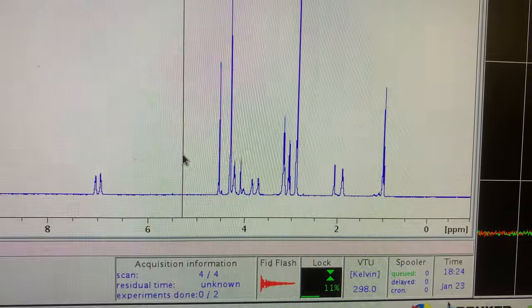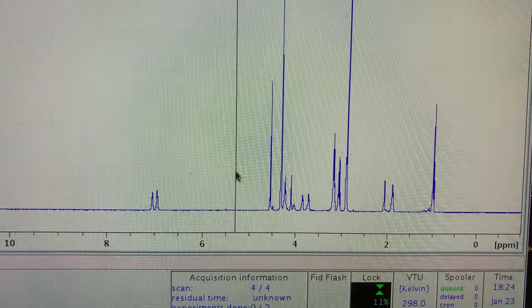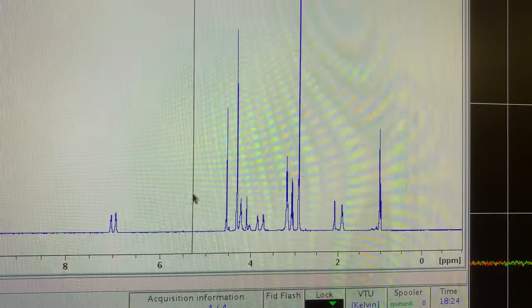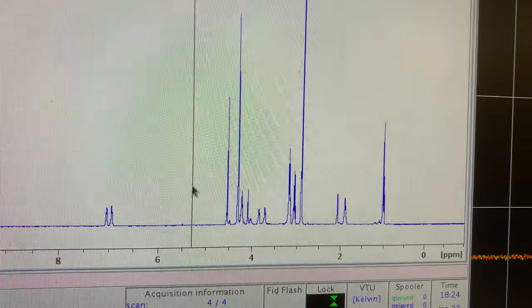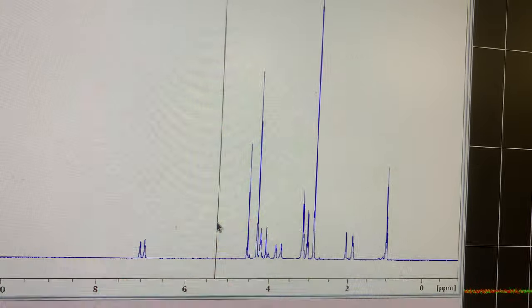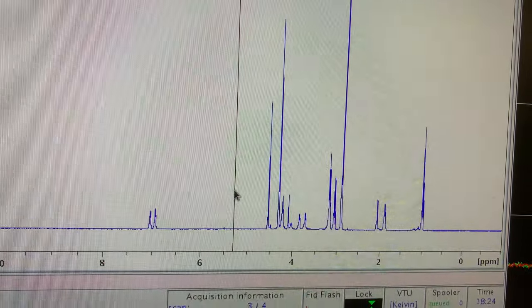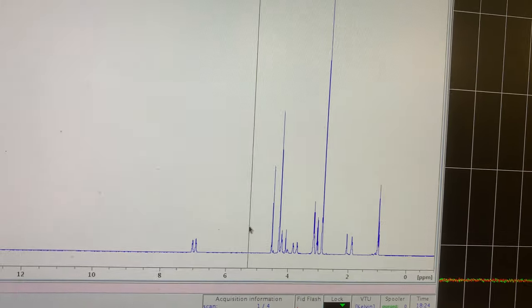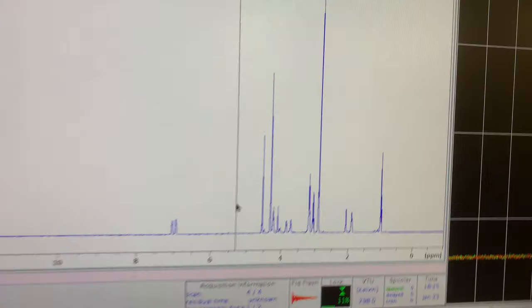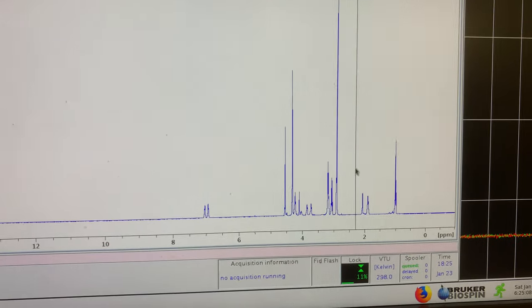It is important for NMR not to have any shoulder in any signal. These signals are important, and a chemist normally understands what each signal is for. Whoever is doing organic chemistry definitely knows the NMR techniques and NMR signals. They can read it like an ultrasound result, where the doctor will know what it is. Similarly, NMR is a very important tool to identify the compound. It gives a certain signal similar to ultrasound, though the mechanism is different, and by seeing the signal we understand what is there.